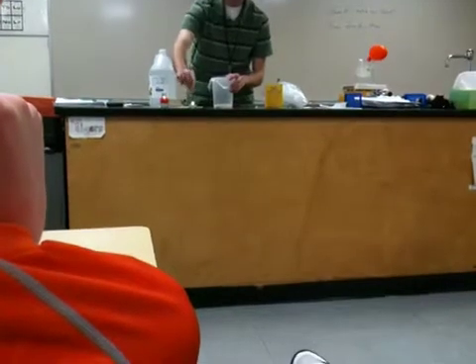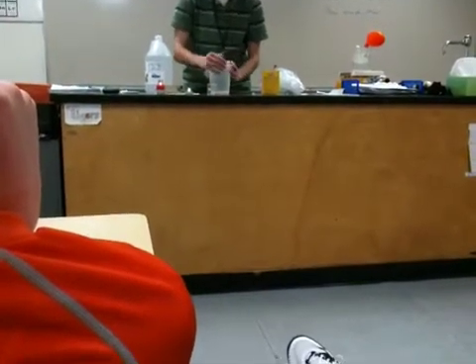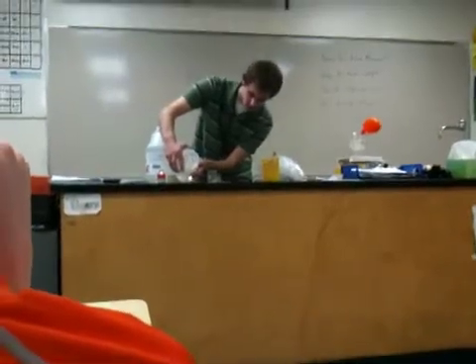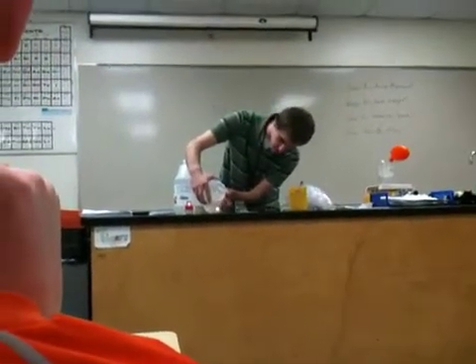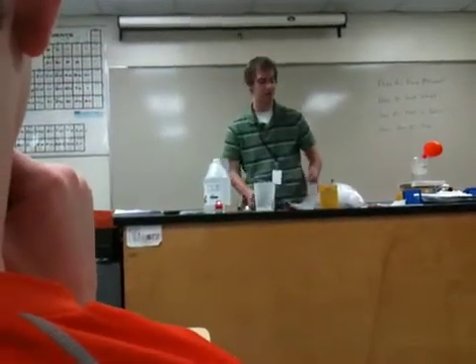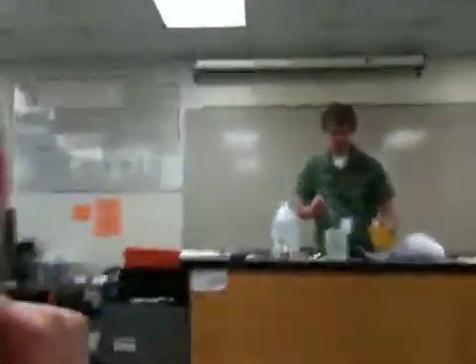If I do it right... and it didn't work. Let's see if we can get it just straight from here. We have to do it. No, come on. Whoa. Did not make enough. This is a harder one to do. If you have dry ice, it's closer. Does it pop or something? No, before the gas is like... It's going to blow up in front of my face.